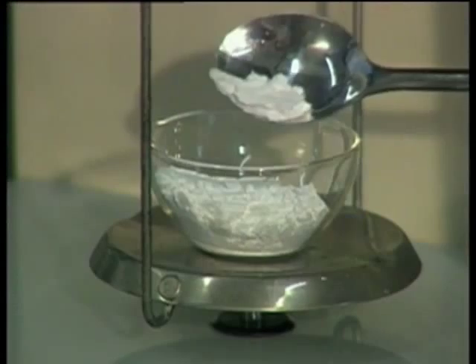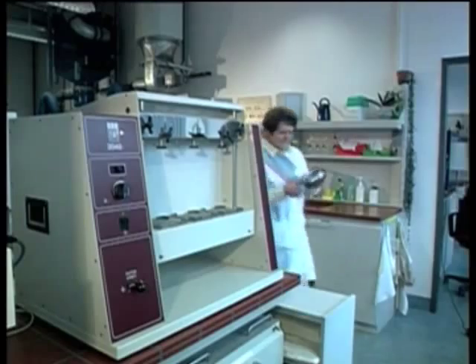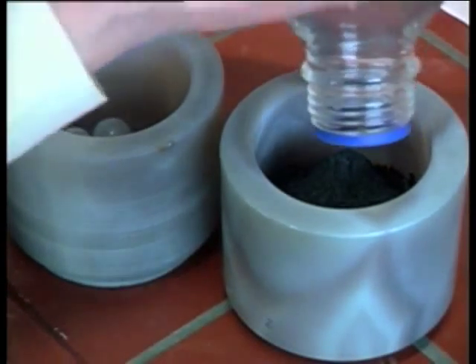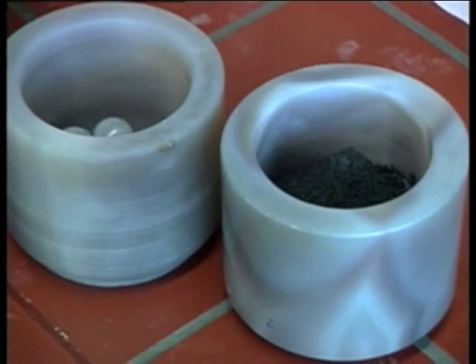First, the powders are precisely weighed in well-determined ratios and then thoroughly mixed. It's important that all components have the same optimized grain size. For this reason, the mixture has to be thoroughly ground in a ball mill.